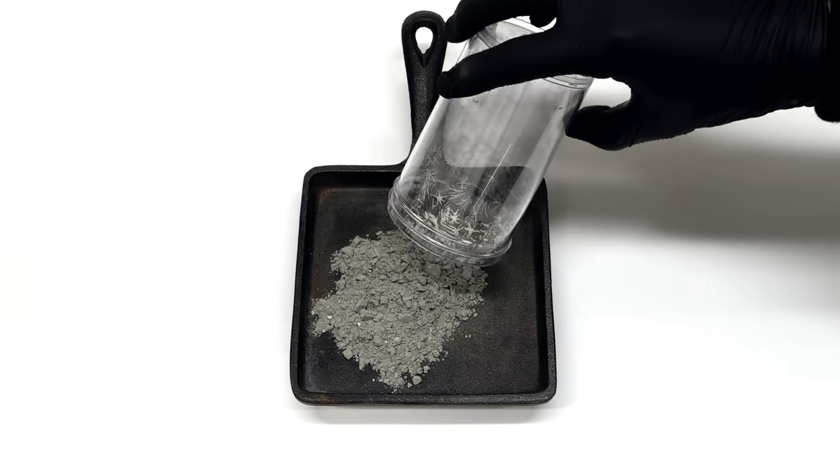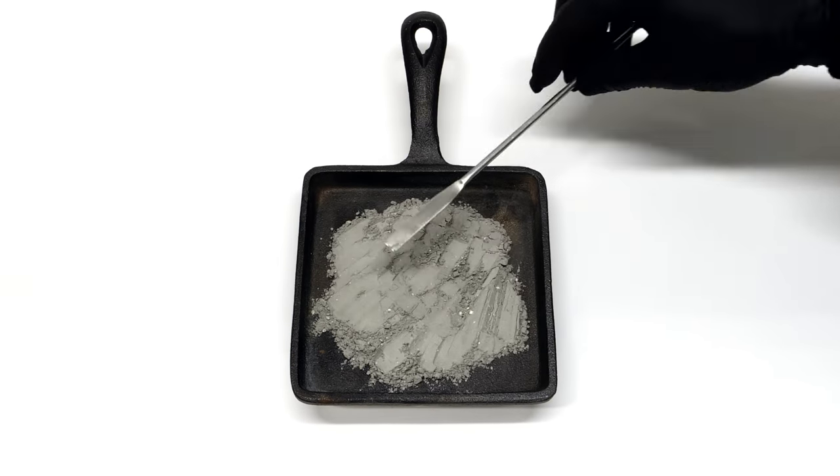It was eventually looking pretty good, so I dumped it all out and spread it out as evenly as possible.